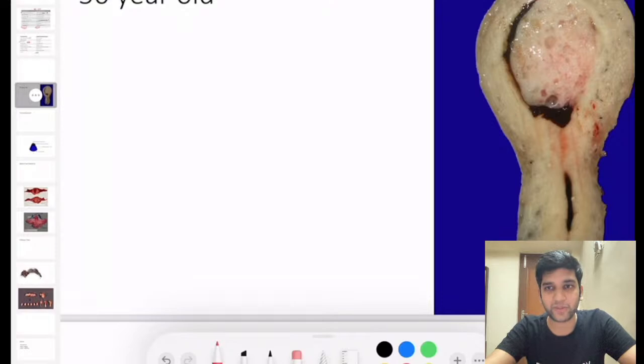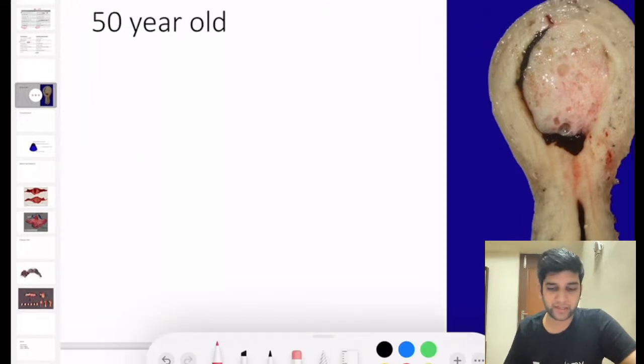Okay, I would start with Dr. Deshmukh. Carcinoma, I would say that's definitely a possible differential diagnosis. Hysterectomy specimen and endometrial cavity distorted, great. That's a good way to start, right? So description is what is all required in grossing. When you go for an exam in grossing, they want you to look for description.